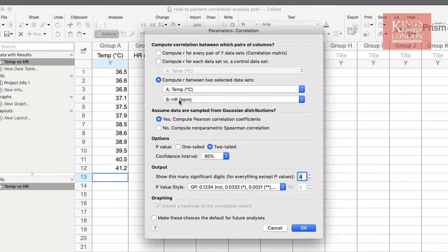The second option is to determine whether you wish to do a Pearson's correlation or a Spearman correlation. The principal difference between a Pearson and a Spearman is whether it is parametric or non-parametric. Pearson for large datasets represents parametric data, whereas a Spearman correlation is normally for non-parametric data. We are going to assume normality here and calculate our R based on a Pearson correlation coefficient.